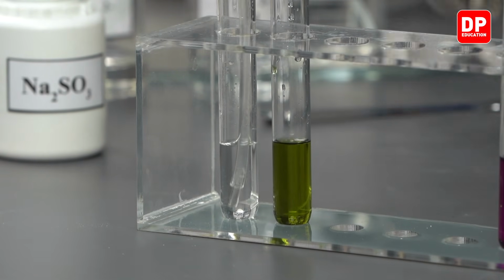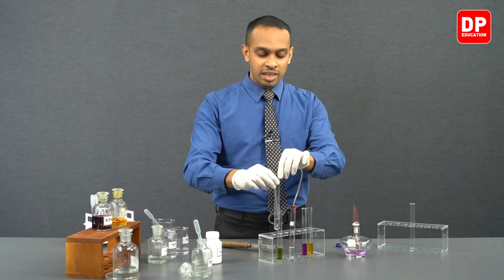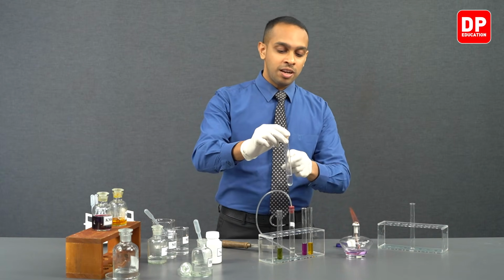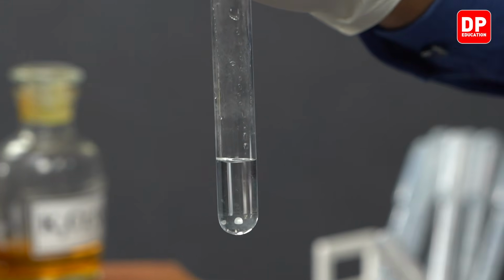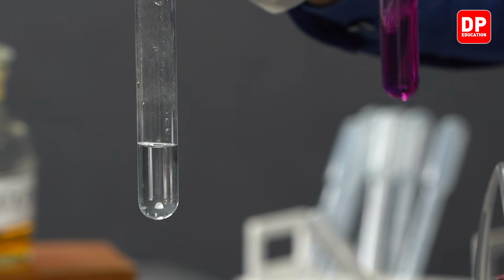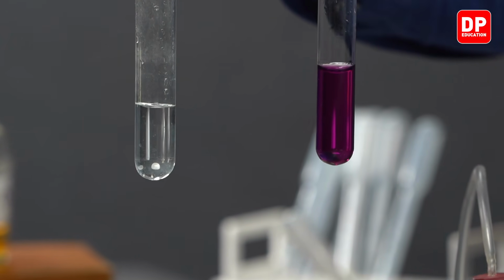Did you observe the color change, students? I hope you did, because we can now see that when we send the sulfur dioxide gas that was produced through acidified potassium permanganate solution, which was purple in color, it has turned to a colorless solution.